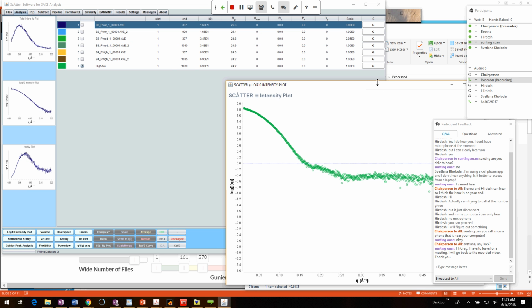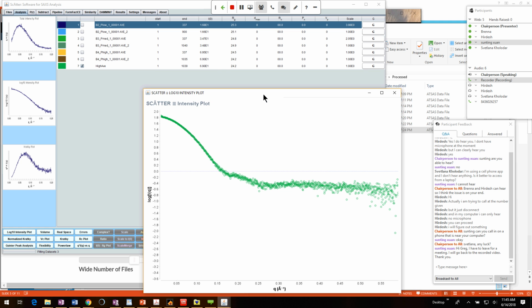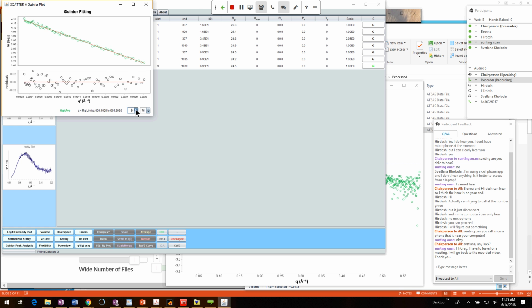So this is my final curve with some of the best of everything. I got my little bump that I wanted to see. So the first thing I'll do is hit the Guinier, and I probably didn't do this quite right, but the way that you can do it here is you trim some of the data off.